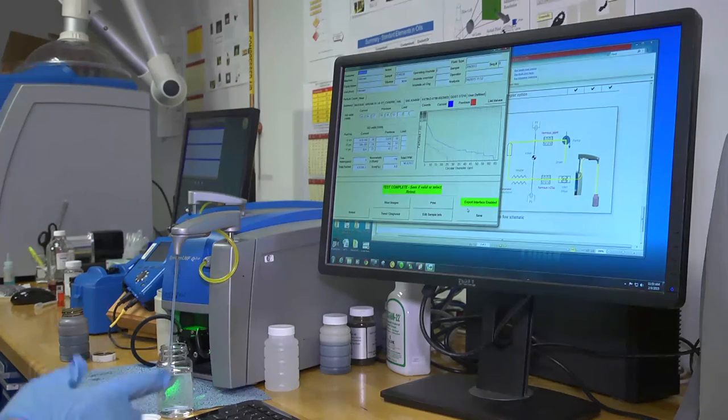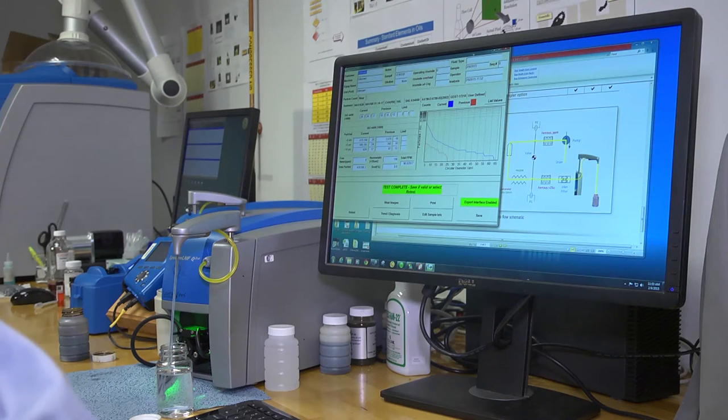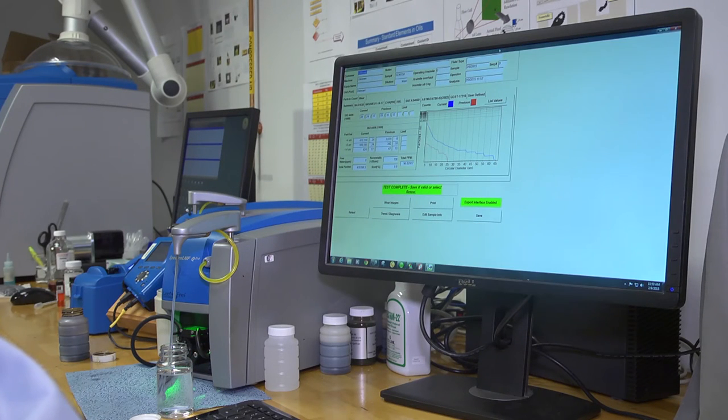So we've finished our flush cycle. And this is the results screen. Let me magnify that.